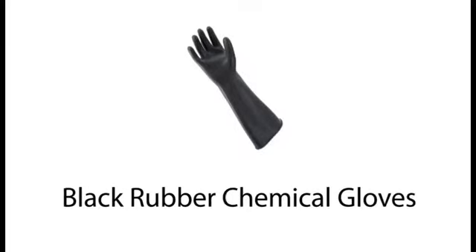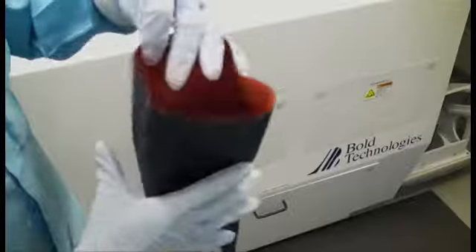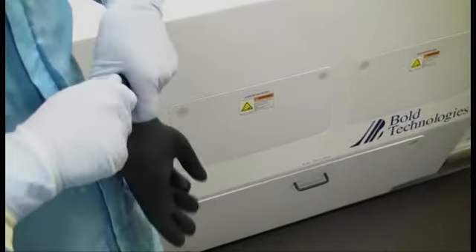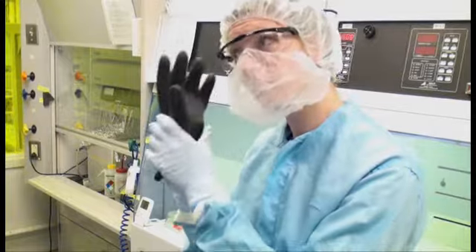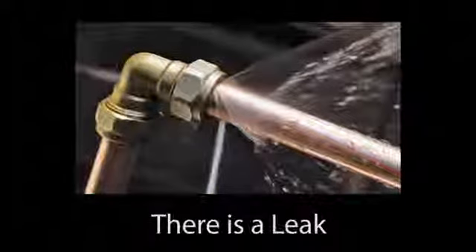When using the black rubber chemical gloves, inspect the inside of gloves for moisture. Do not use gloves that are wet inside. To test the gloves for leaks, first open them wide, then fold over the open end so that air is trapped inside. Squeeze the glove, and if you hear or feel air escaping, there is a leak. Do not use gloves that have a leak.